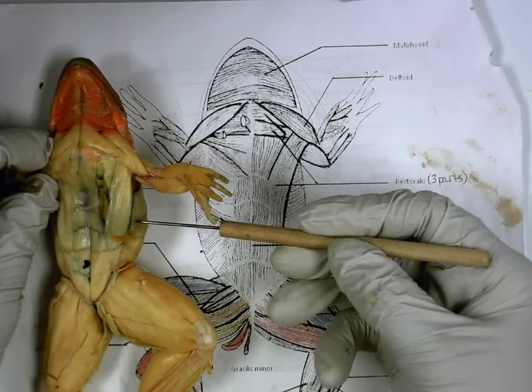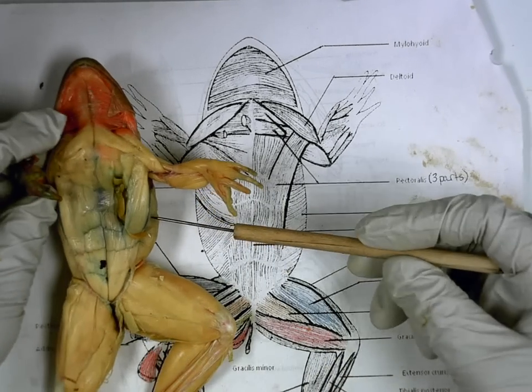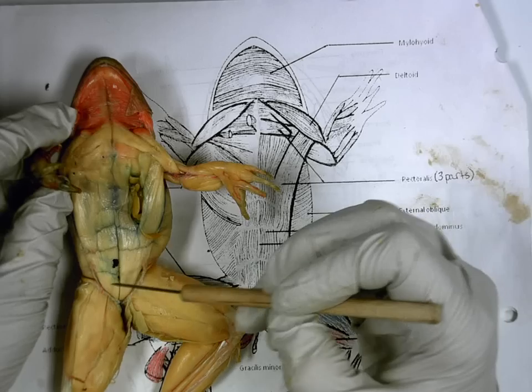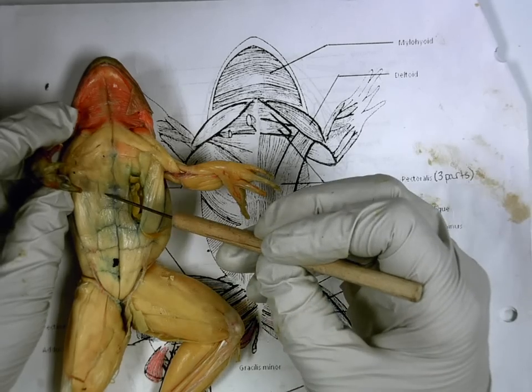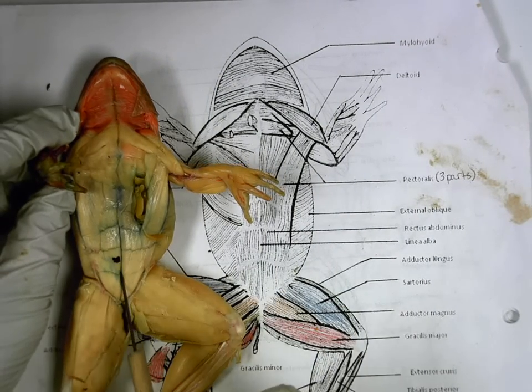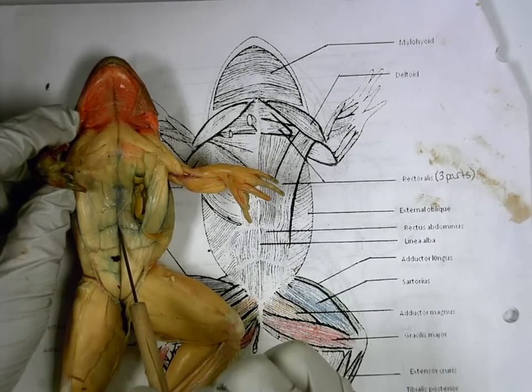Then we have the sides. The sides are always external obliques. Then we have the six-pack, rectus abdominis. Then we have what's running down the middle. This line is called linea alba.